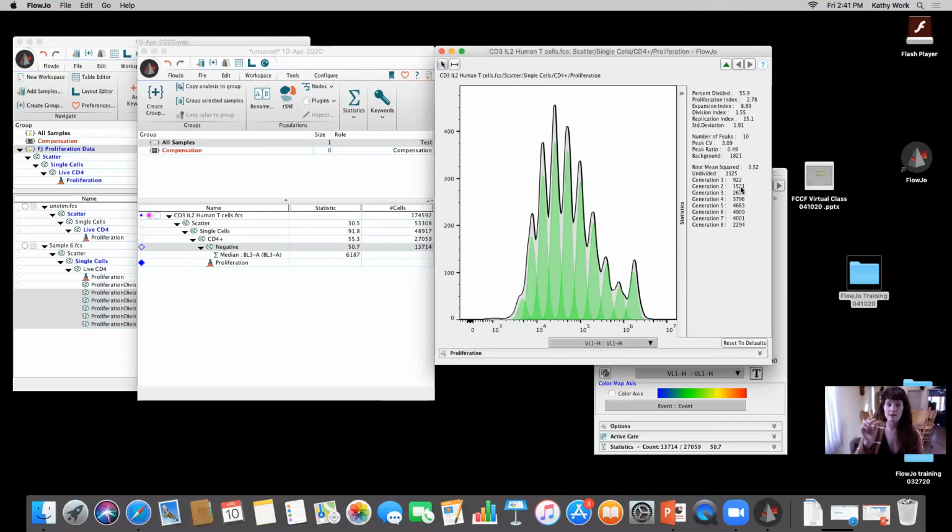I could take a look at the stats and go in and draw some gates and see which one pulls out better, to try and understand it myself, but I don't have too much experience with the Attune. It looks like both are modeling the way they should, but there might very well be a technical aspect to preferring height for the Attune. In some cases, yeah.